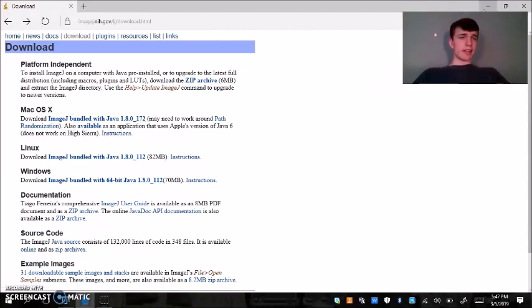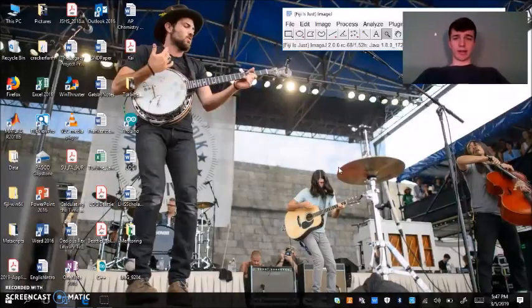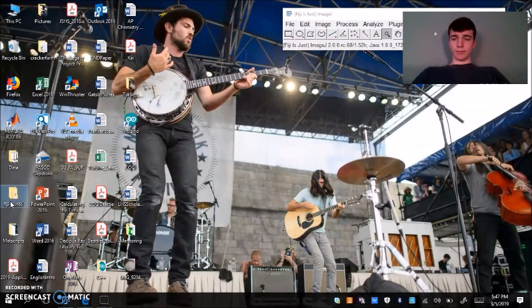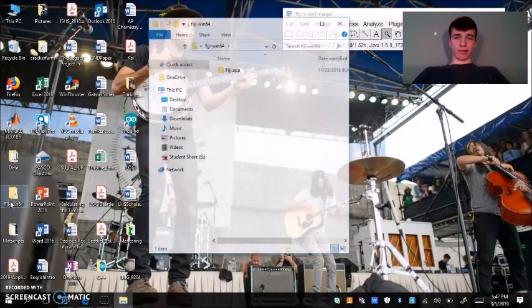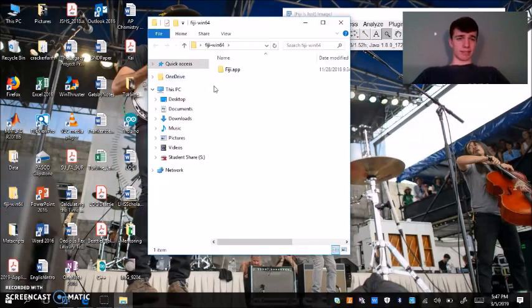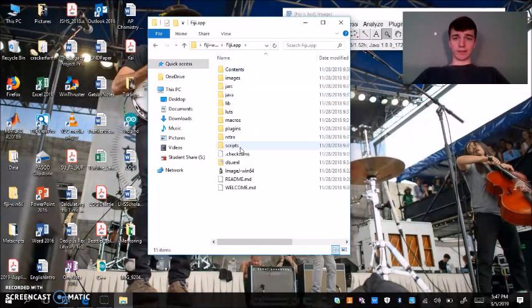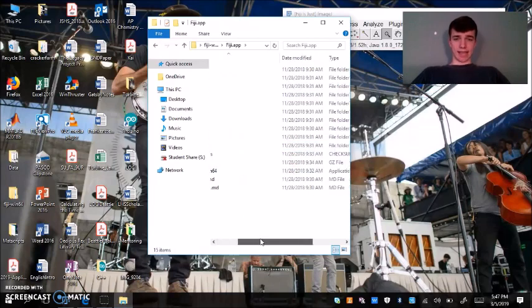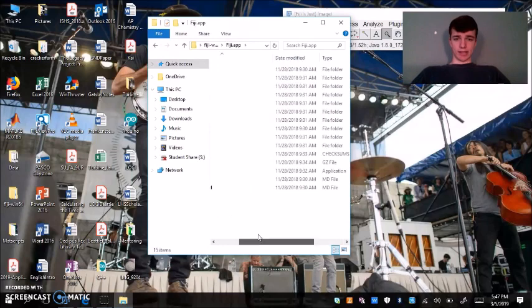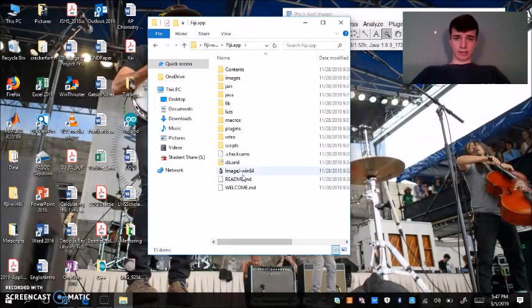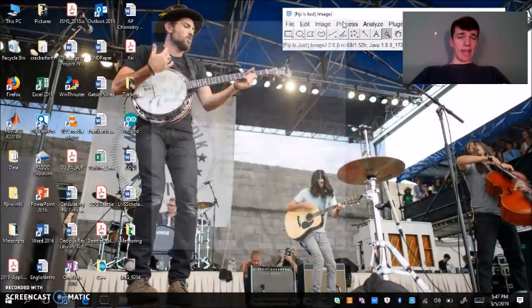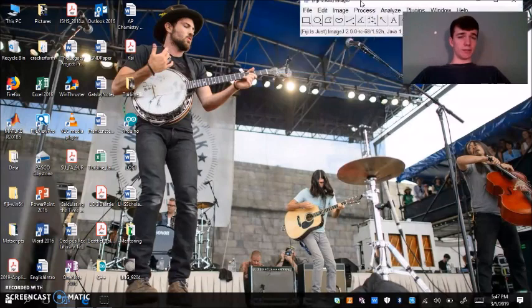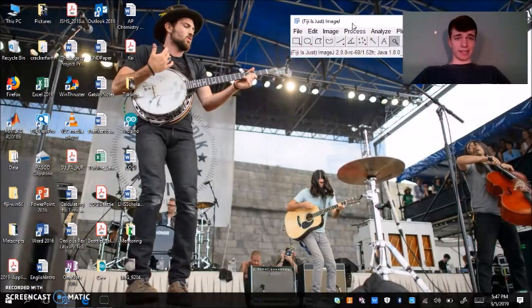Since I already have ImageJ downloaded on my computer I'm just going to open it. Once you've downloaded the folder it should look something like this. You'll just go into this folder and click on this application file called ImageJ-164 and it'll open up a toolbar that looks like this.